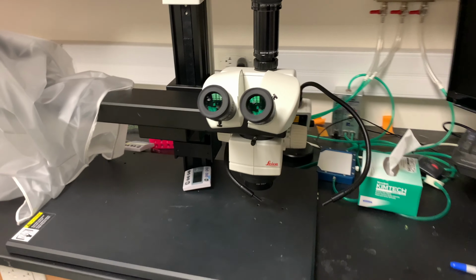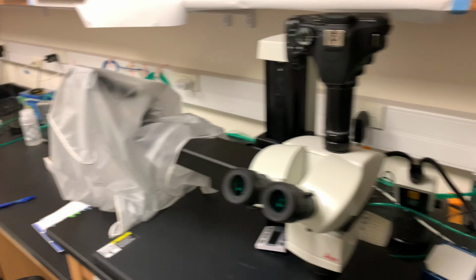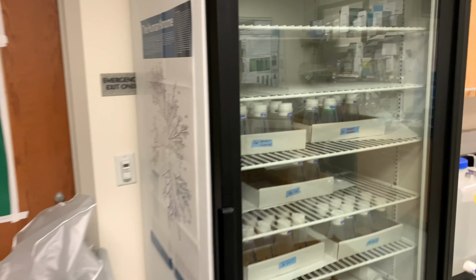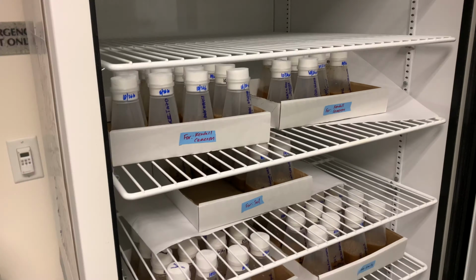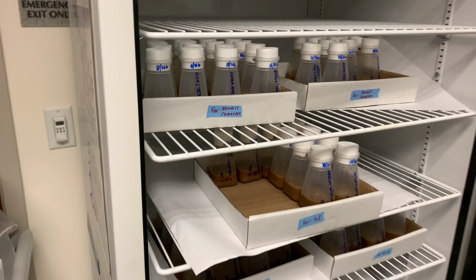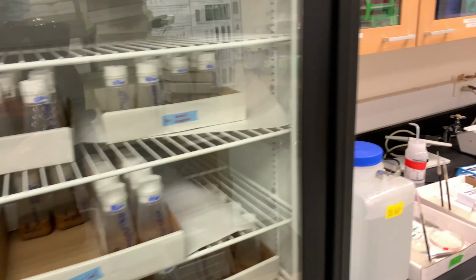Alright guys, so I'm going to give you a quick tour of the lab and show you some of the stuff that we work with. This is one of our 2 microscopes that we use to dissect the flies. The other microscope is right here. It's covered right now because I usually prefer to use this one. Over here is our fly incubator, where we keep the different genotypes of flies that we're going to experiment with. My box is right here, and I'm going to be picking out 2 of the genotypes to dissect today.